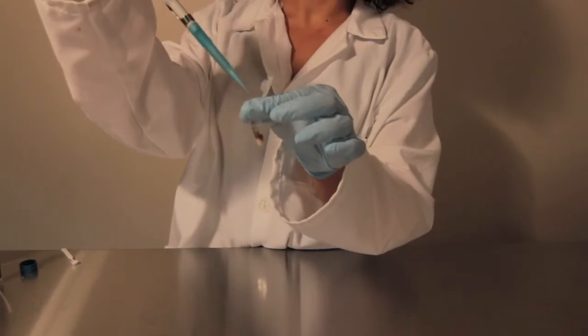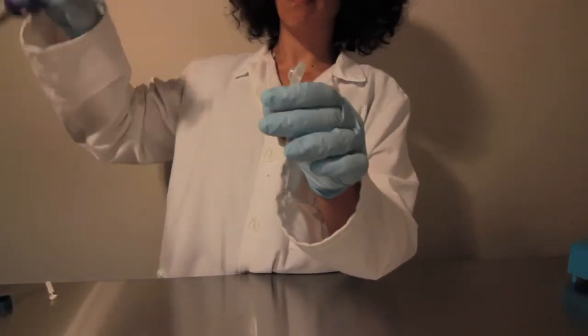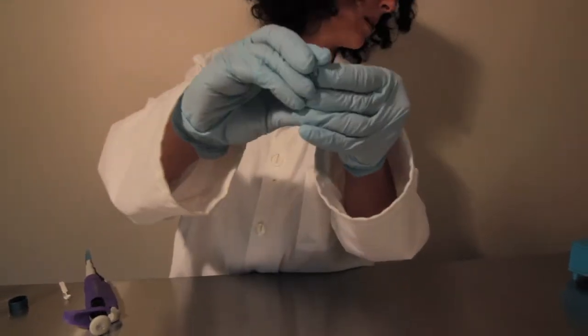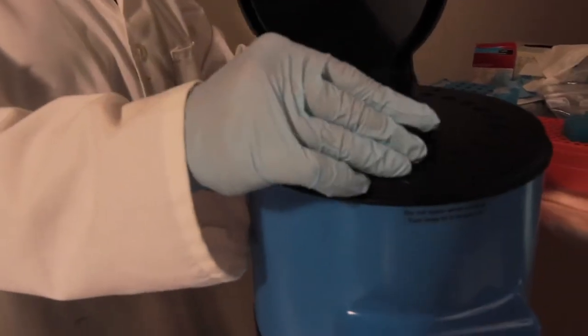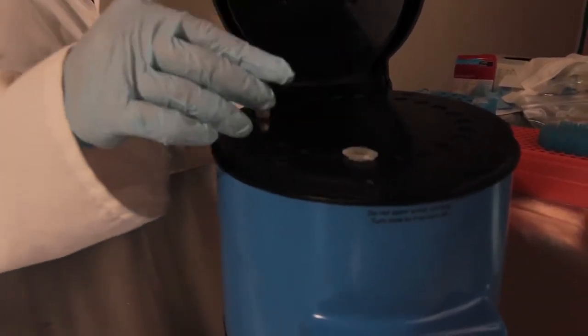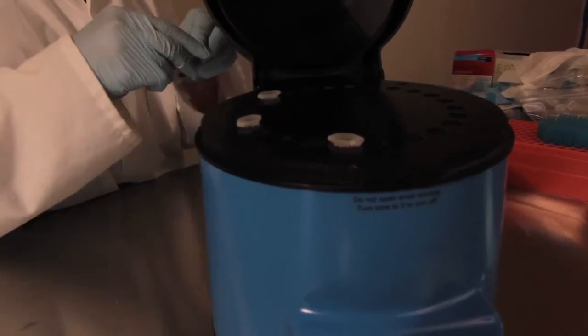Finally, add a volume of buffer or reagent that is twice the volume of beads that you're using. Now, completely close the caps of your tubes and place them evenly spaced inside of the Bullet Blender. I have 8 samples loaded. I'm going to set the speed to 8 and the time to 3 minutes, close the lid, and press Start.